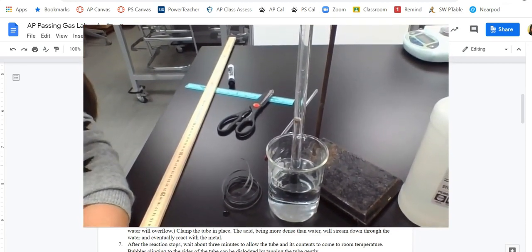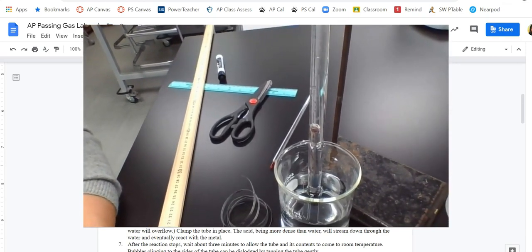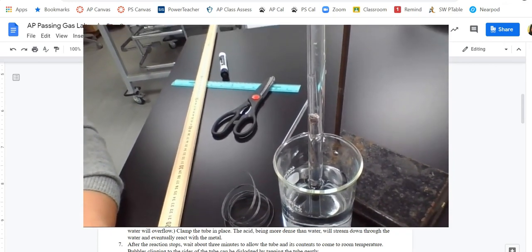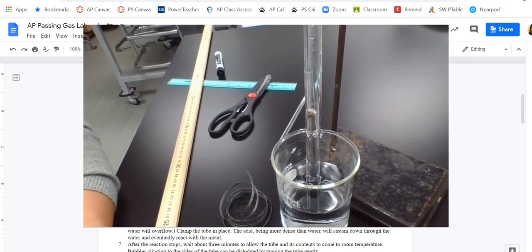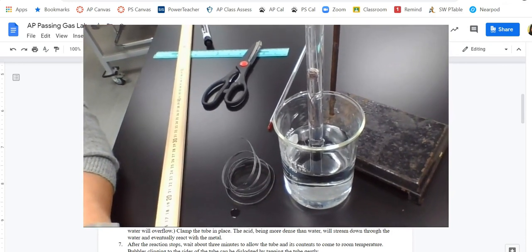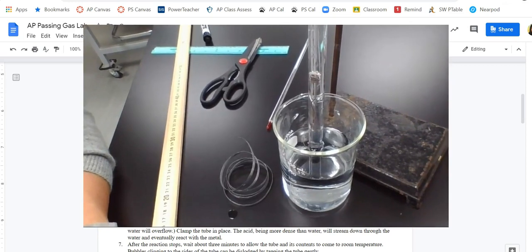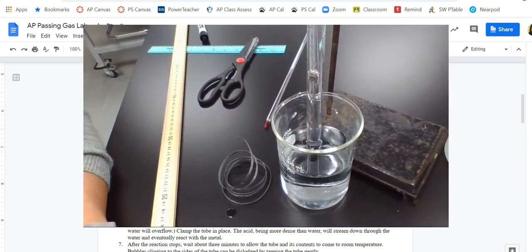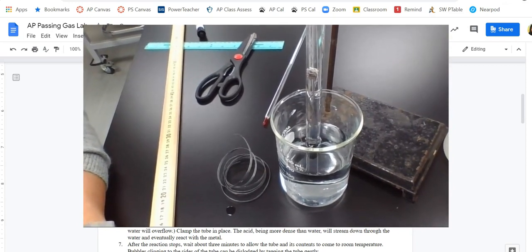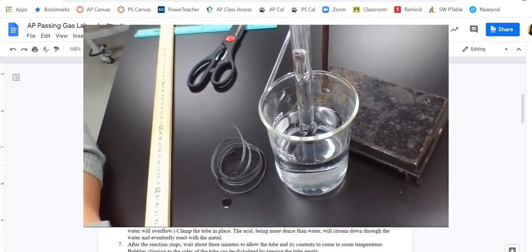All right, I don't know if you can see this here, but there are definitely bubbles starting to form, and I can see that those bubbles are forming right around that magnesium. And the stopper is not all the way on the bottom, and the reason for that is otherwise that hole has no use. So if anything needs to get kicked out, I need somewhere where that volume can change. So let's start taking a look here.